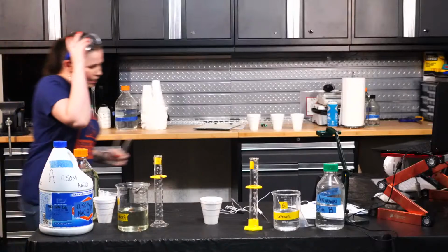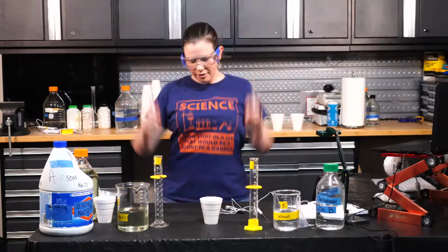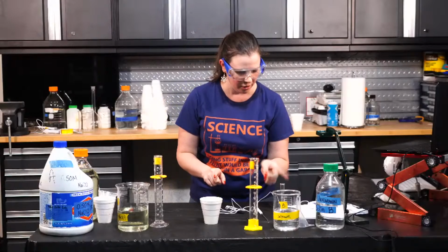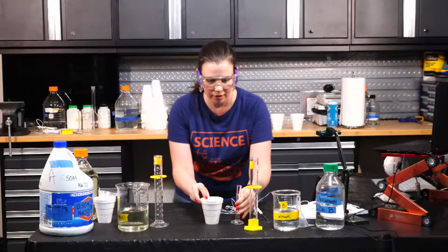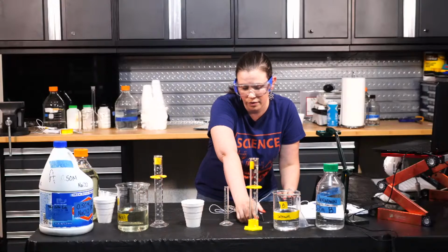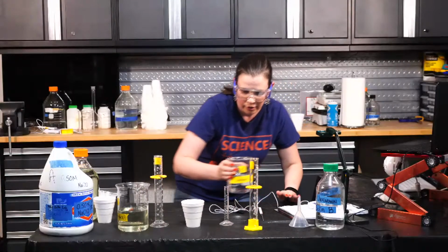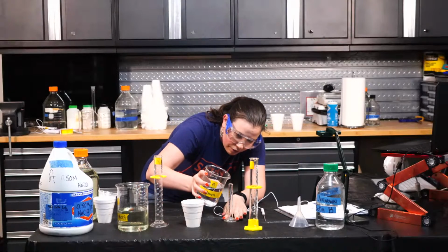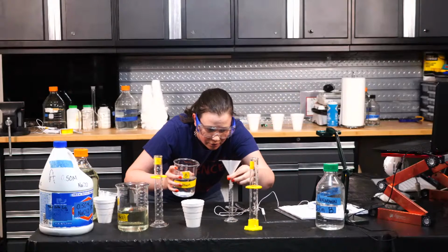Okay, don't run in the lab, right? Got it. 10 milliliter graduated cylinder. So we have 45 of the bleach in. We need 5 of solution B. Because there are no markings under 10 milliliters on the 100 milliliter graduated cylinder, we're going to switch over to the 10 milliliter one and do 5 milliliters. Actually, I'm going to use my funnel too so it doesn't spill.